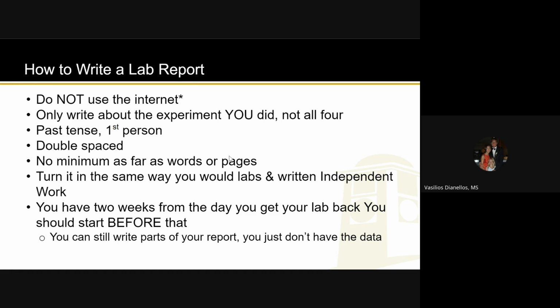You don't want to say, first, I looked at the cuvettes and I chose the one closest to the left and I picked it up and I gently placed it under the lamp, ensuring that it was straight and that I could see it. And then I chose my next cuvette and I picked it up with my right hand in between my first finger and my middle finger, right? You don't need to do all that, right? It's not a narration, just straight to the point. That's what you want to do.